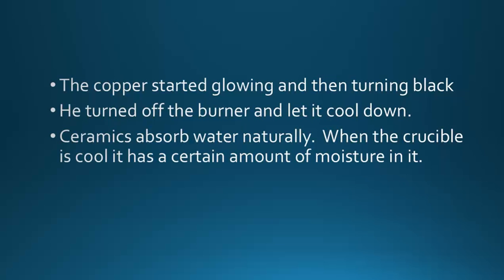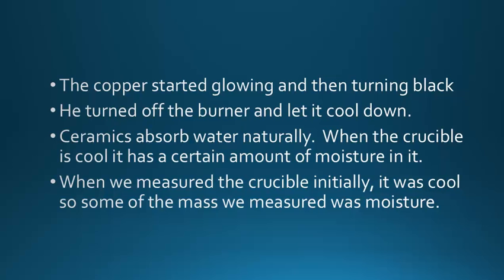Ceramics absorb water naturally. This is very important that you remember this. Ceramics normally absorb water. So if you have a cool piece of ceramics, there's going to be a certain amount of water. Is it enough to measure? Just barely. Okay? So when you heat up a crucible, that water leaves. That water is driven away. So a cool crucible will have water, a hot crucible will not. So when we measure the crucible initially, it was cool. So some of that mass is going to be water.